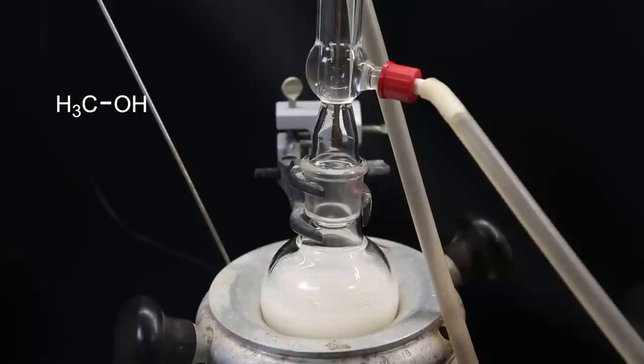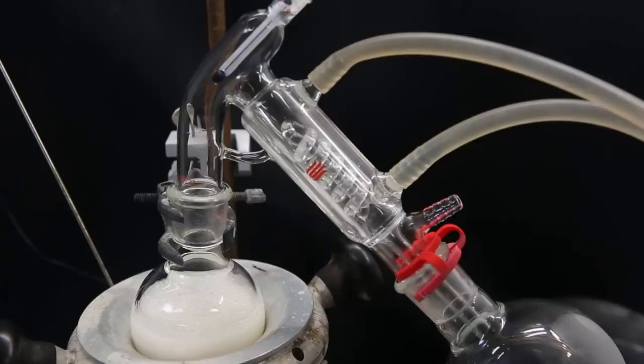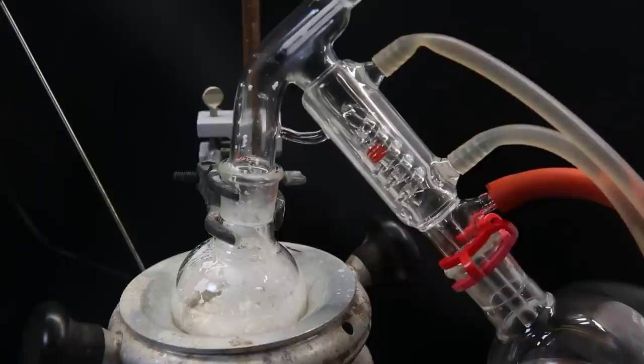But because of the formation of methanol during the reaction, as time goes on, it will disfavor the formation of the product, because there's too much methanol around, and the reaction comes to a standstill when in equilibrium. To fix this issue, I first have to remove all of the solvent from the mixture with short path vacuum distillation. When all of it is gone, I am left with a white solid. Now that also all of the methanol is gone, the reaction can be restarted to get a better yield.